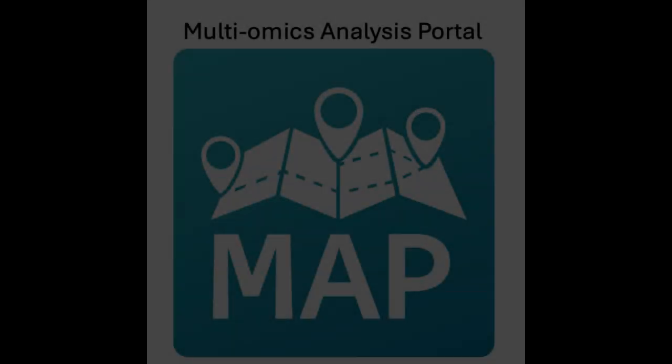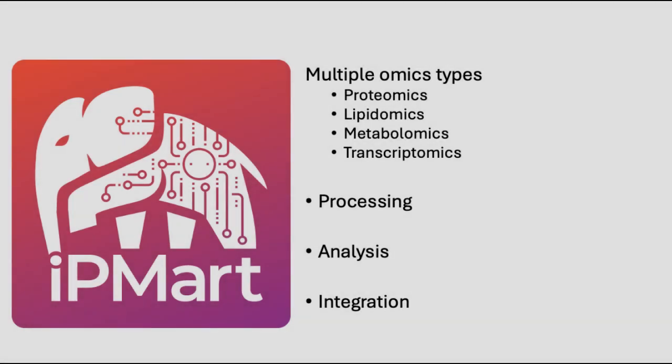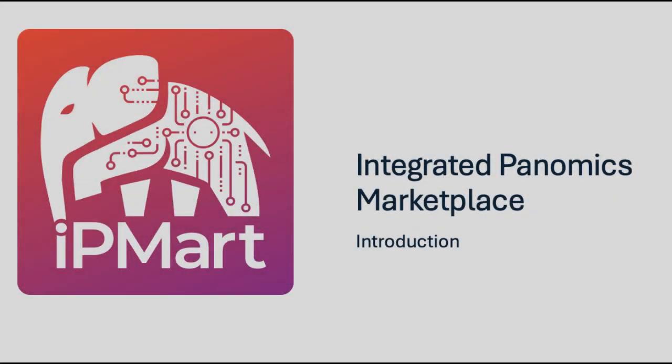For your reference, the term MAP refers to Multi-Omics Analysis Portal, which is the hub that holds several web applications for processing omics data. Overall, iPMart is an application made for the processing, analysis, and integration of multiple types of omics data. It can currently support proteomics, lipidomics, metabolomics, and transcriptomics data. More details on the input data format can be found on the Goals tab of the app.